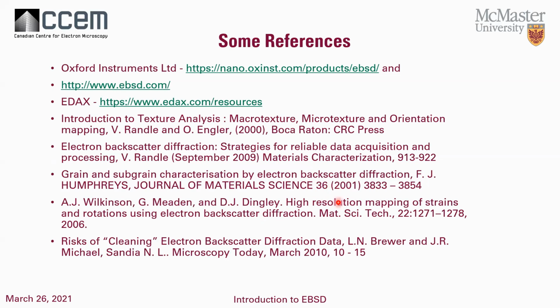Now, there are a lot of good references or sources for information. You can go to the Oxford Instruments website. The EDAX website also has a lot of resources and information as well. Quite good. They have quite a collection of papers. It's quite useful. One book I find very useful if you're going to be doing texture analysis is the book by Valerie Randle and Olaf Engler. It's a very good introduction to texture analysis. So a lot of information there.